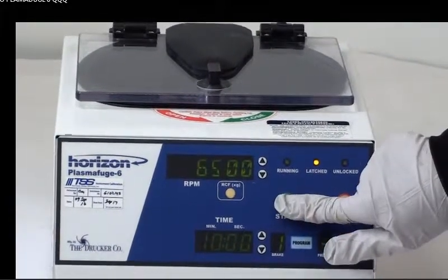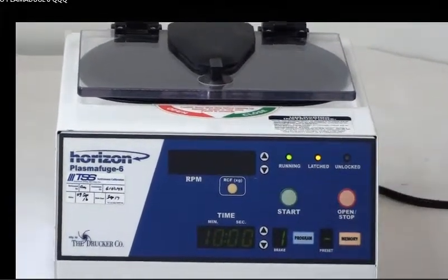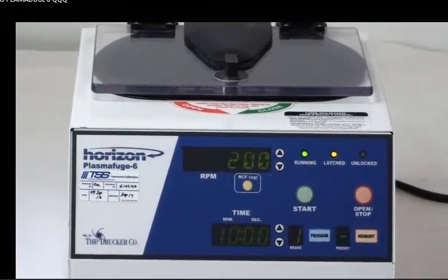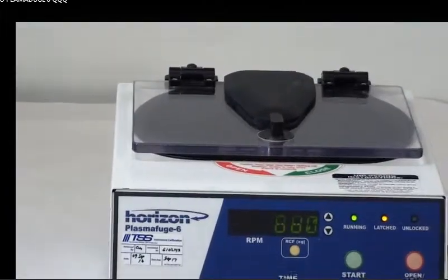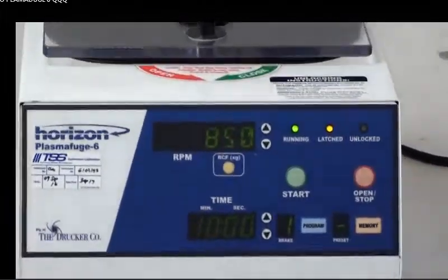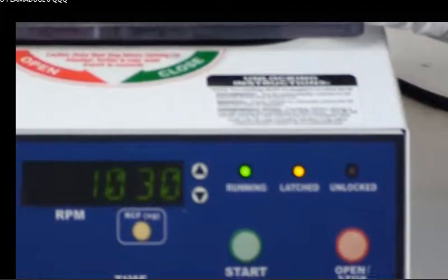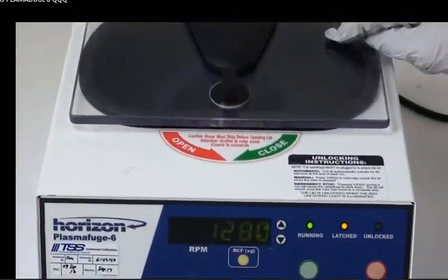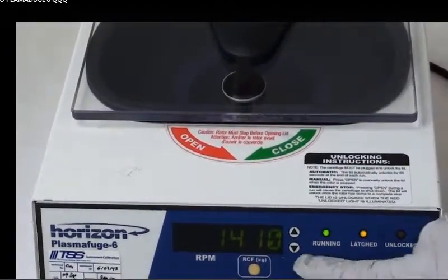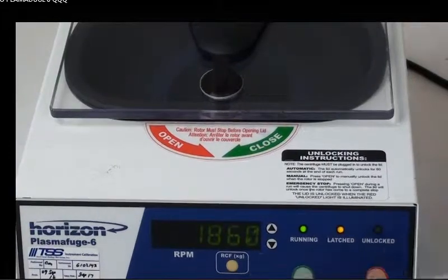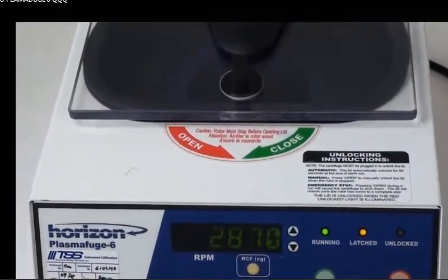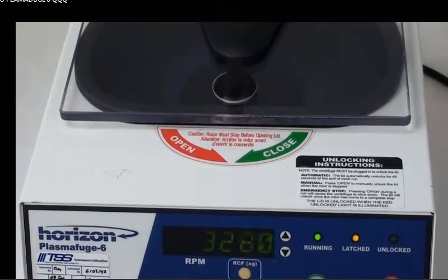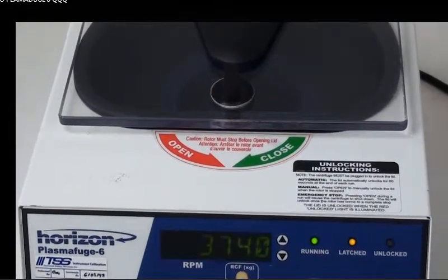I'm going to start it up. You're going to see how quickly this accelerates and you'll hear the sound of it. It sounds like a jet engine. I'm going to have air come in quickly just to get a view of how quickly this accelerates and what it looks like inside the latch. You can see the screen is keeping up to pace with how quickly this is rotating, and as it builds up speed you can hear the sound amplified.